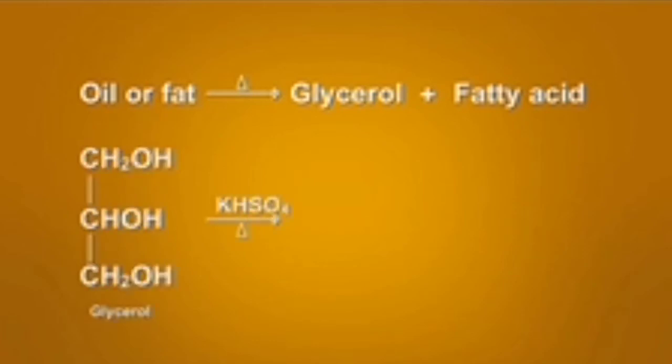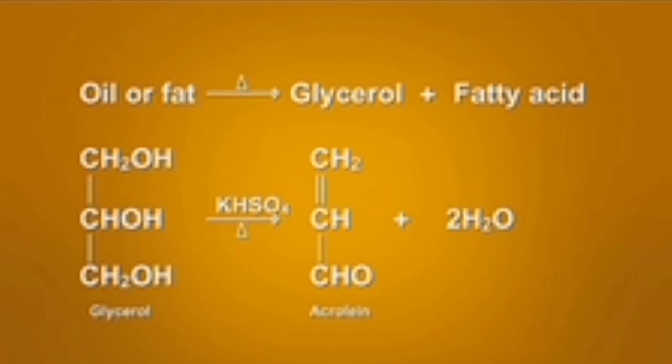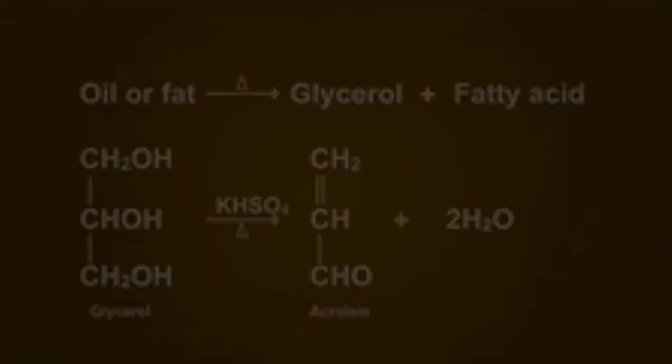When oil or fat is heated strongly in the presence of a dehydrating agent like potassium bisulfate, the glycerol portion of the molecule is dehydrated to form an unsaturated aldehyde, acrolein, which has a pungent, irritating odor.